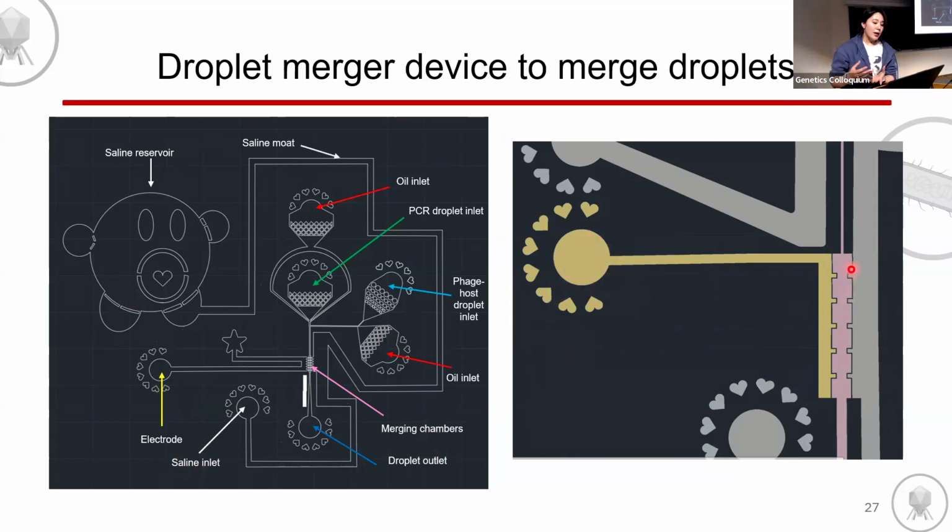You can see that the space is really tight for where the droplets come down, and that's to ensure that the droplets are able to stack on top of each other, so you get 1 and 1. And then as you go towards where the voltage is applied, the droplets will actually fall apart, and then as they move further down here, they'll be able to merge together.